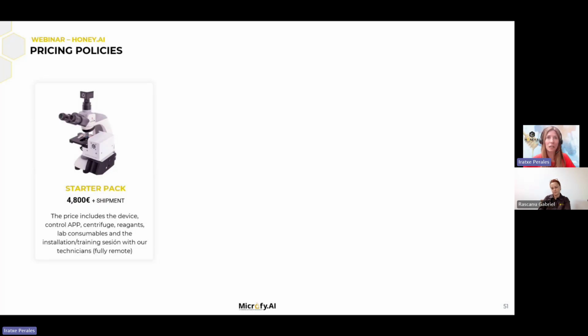Here in Spain, the 2 public labs that are working with us want to accredit themselves, and it is possible. We have already talked with ENAC. They say that they don't care if it's an AI or a human, that they can accredit the method anyway. And they have already started the documentation and the steps to be done. So soon we will have clients accredited with our system.